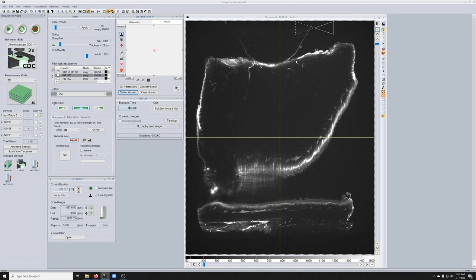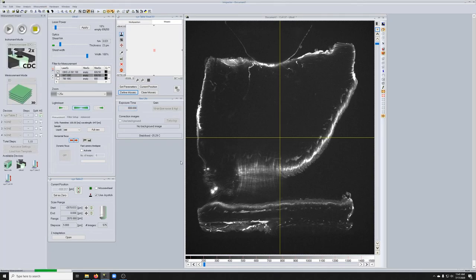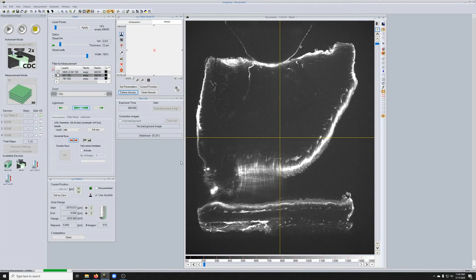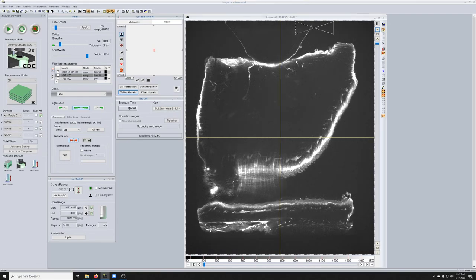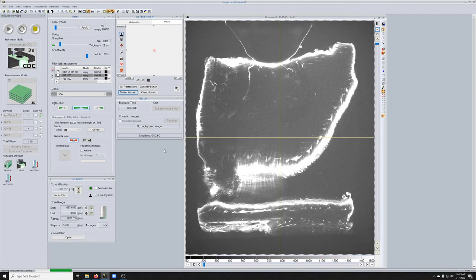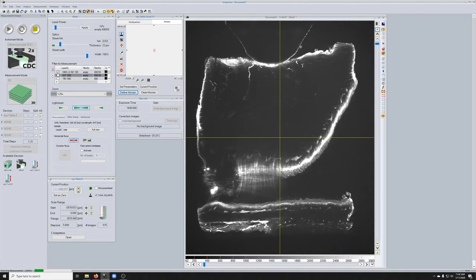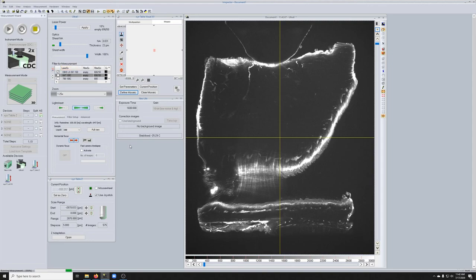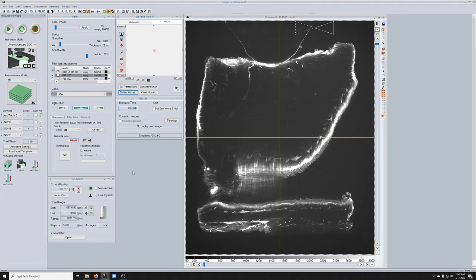What if we go to 800? You can see the quality looks quite good. What if we go to 1600? I'm going to double this. Between 1600 and 800 there doesn't seem to be a huge difference. So maybe an 800 millisecond exposure is going to give us the quality that we want.